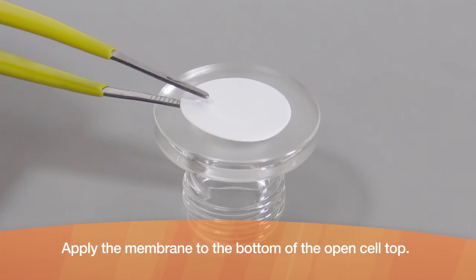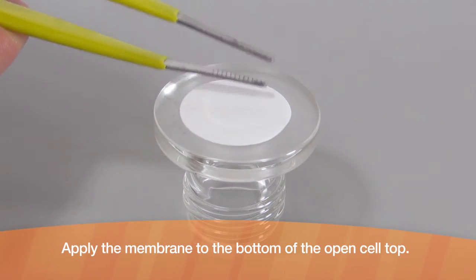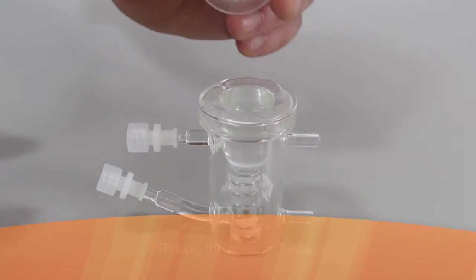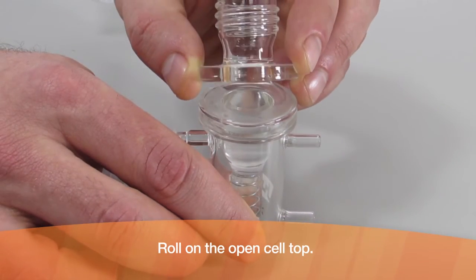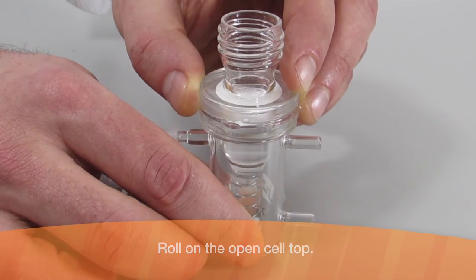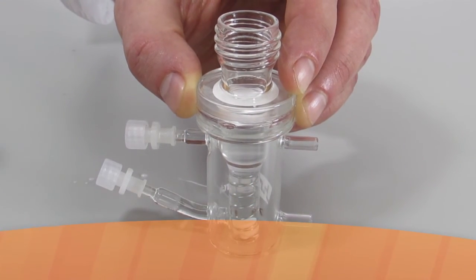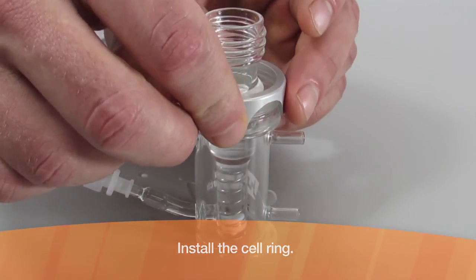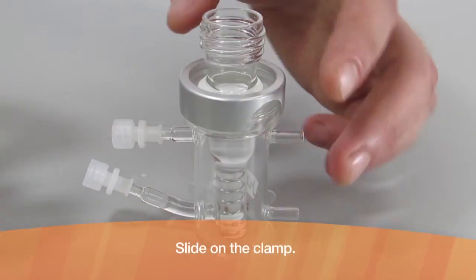Apply the membrane to the bottom of the open cell top. Roll on the open cell top, install the cell ring, and slide on the clamp.